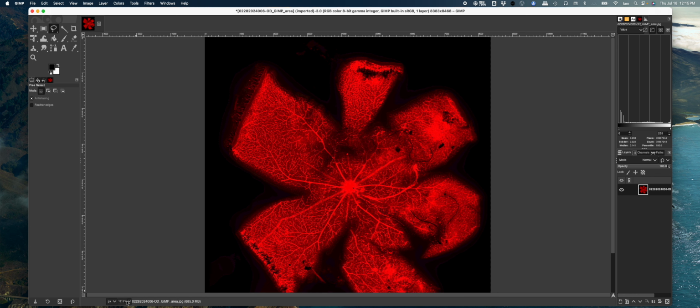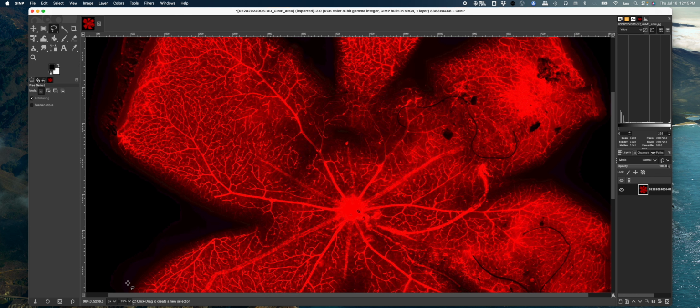So I would go down here. You can do some pre-selections. So for instance, if you come up to this kind of scale, as I'm looking at boundaries, I'll be able to see very easily where the boundaries are and also where there's just some ripped tissue. And the default mode for this will just be polygonal, which means I'm going to start doing this here. I'll show you.